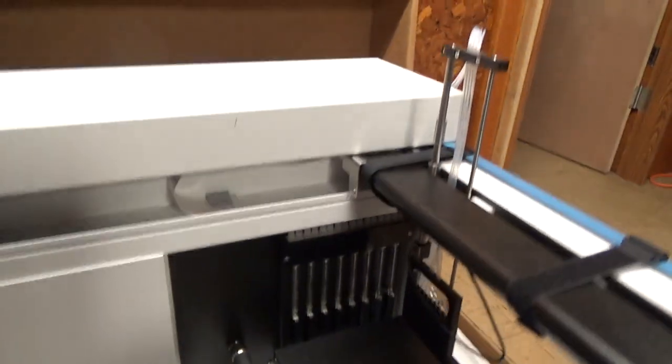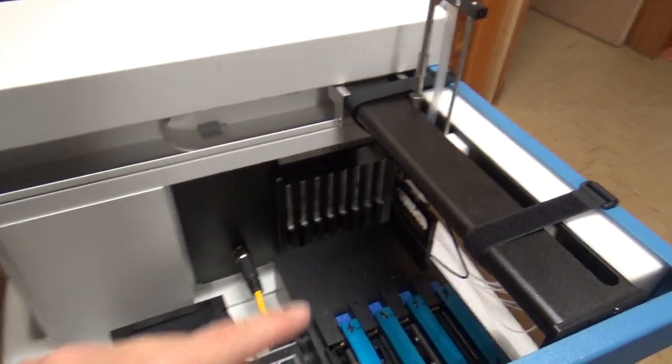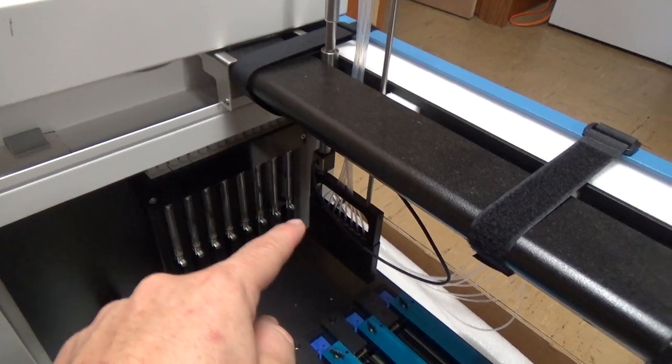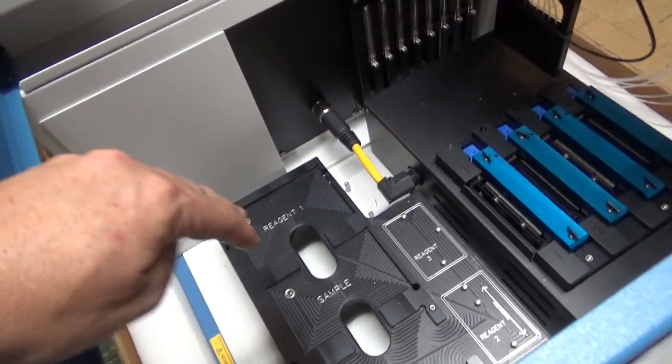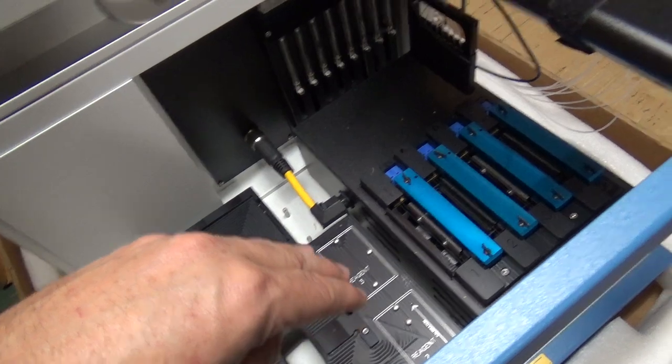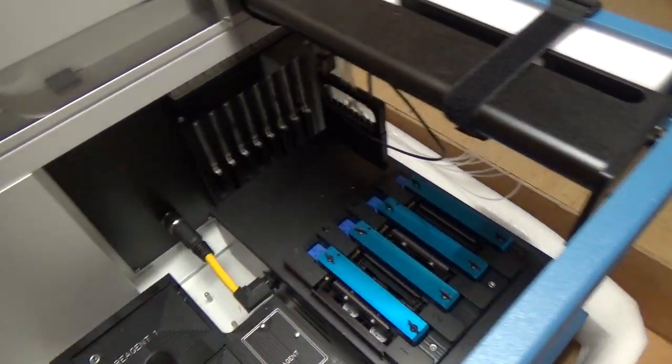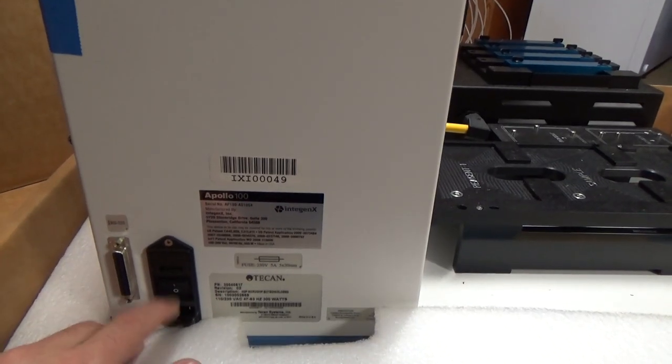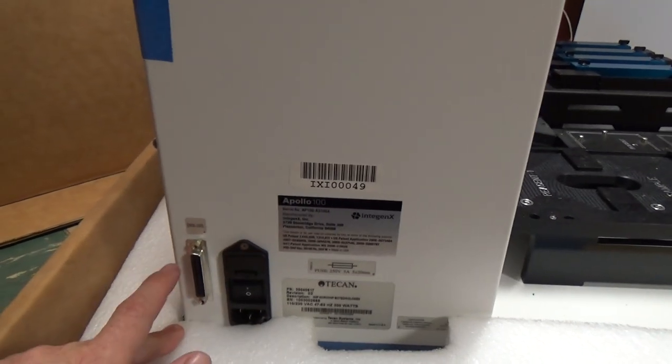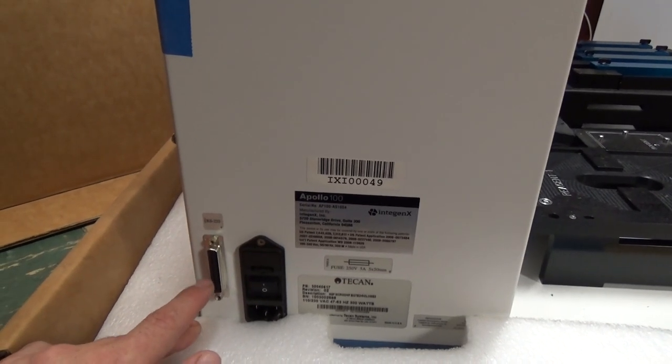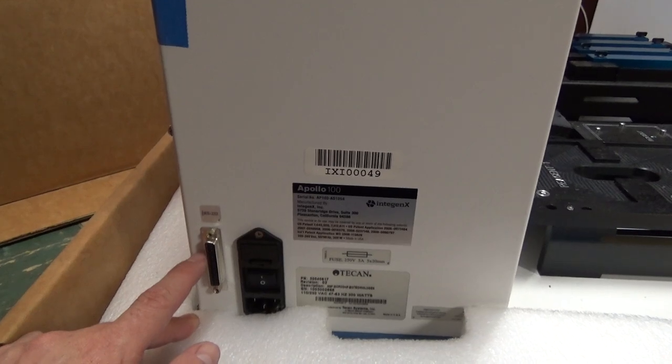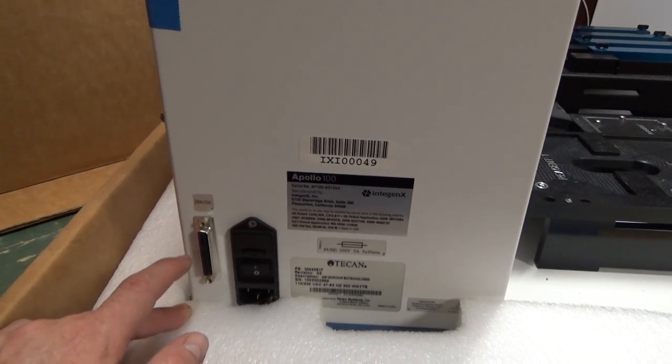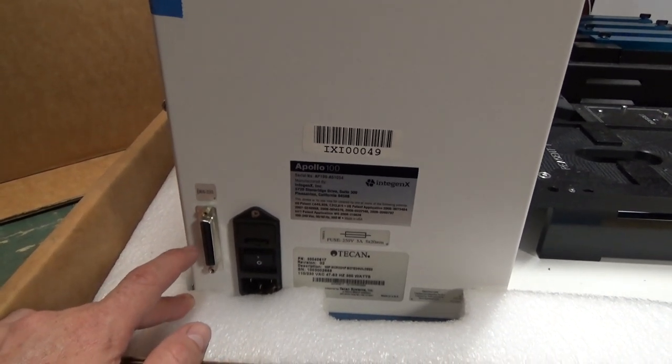It's got this XY axis like a 3D printer up top. And then this little fluid handling arm that I guess comes down, grabs stuff out of the samples and the reagents, and then drops it onto those cartridges. Got our big old power switch, our power input, and our serial port straight out of the 1970s. Remember when serial ports were the size of printer ports? Heck, does anyone remember serial ports and printer ports?